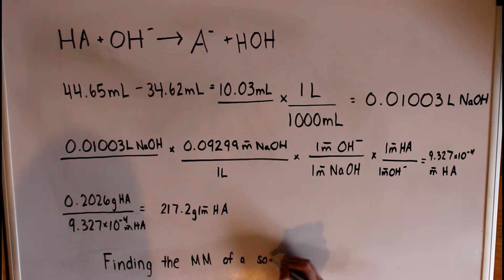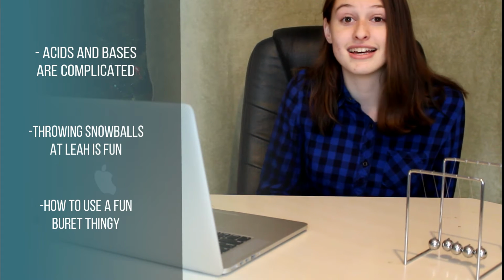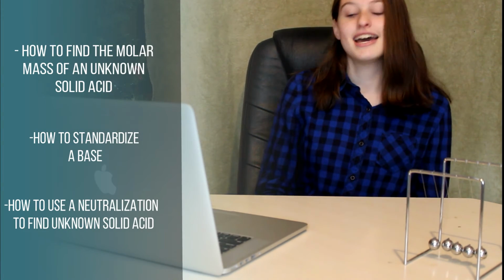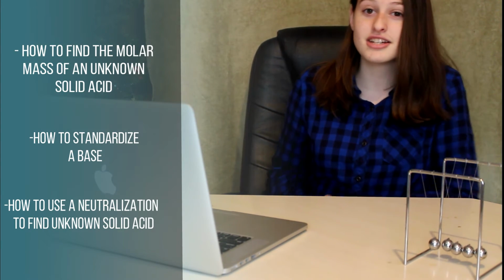If you were paying attention, you may have learned acids and bases are complicated, throwing snowballs at Leah is fun, how to use a fun burette thingy, but seriously, how to find the molar mass of an unknown solid acid, how to standardize a base, and how to use a neutralization reaction to find the unknown solid acid.